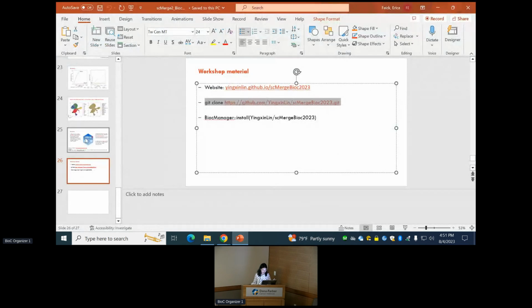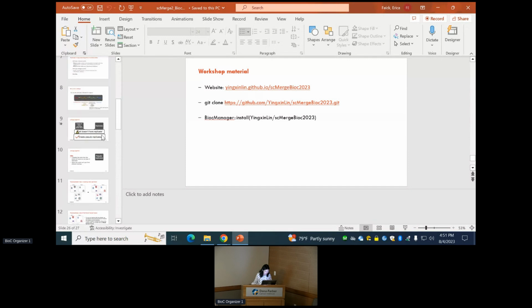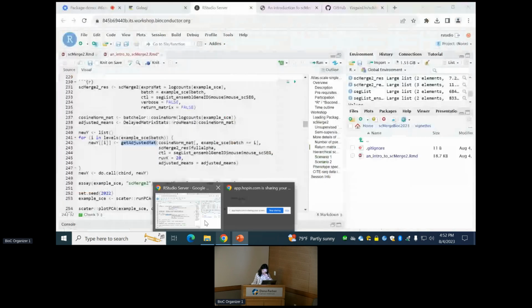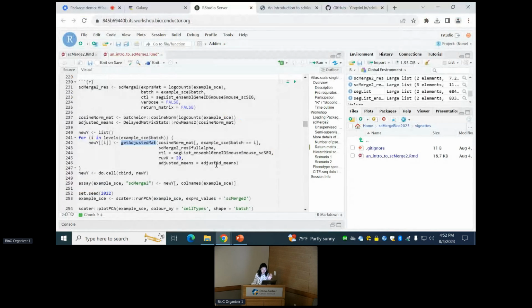This is just doing the adjustment at the end, so it's just this part. After we estimate the alpha, this part does the W times alpha and then Y plus this operation. And this is actually the one that will blow up the memory. So the idea is that I usually do this part by batches, and each time I have the adjusted matrix, I save it to the H5 file.